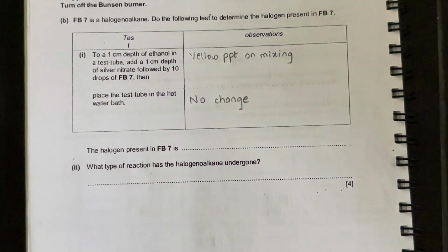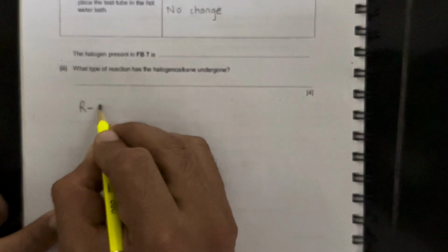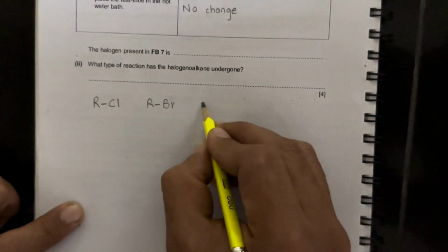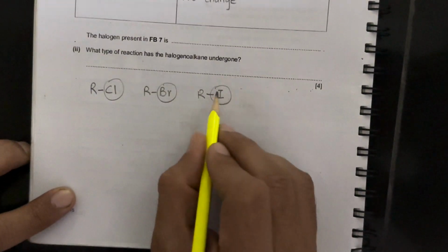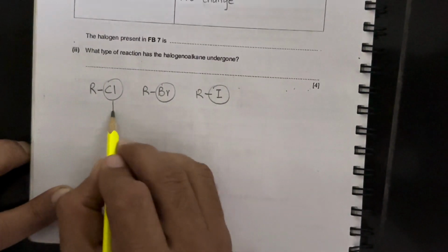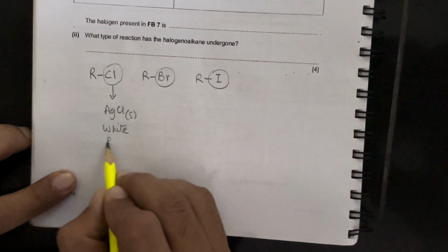Now let's see, if we have a carbon chain, the halogen could be chloride, it could be bromide, or in a carbon chain it could be iodide. So for chloride, bromide and iodide, we test in this way: we add silver nitrate, and if it gives silver chloride, the precipitates are white.